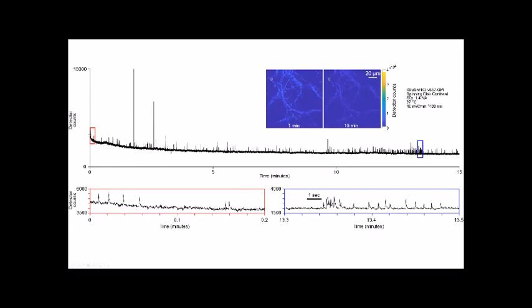There's a little bit of bleaching over the course of this recording. Actually, there's a moderate amount of bleaching. But what I want to point out is that the signal to noise ratio actually doesn't decrease at all. It mildly increases in this recording because most of what's bleaching is actually unproductive background fluorescence. And so we were able to do very, very long recordings of this indicator.